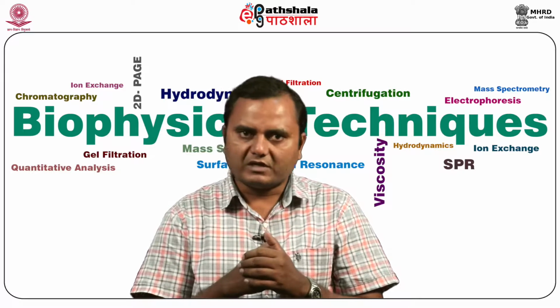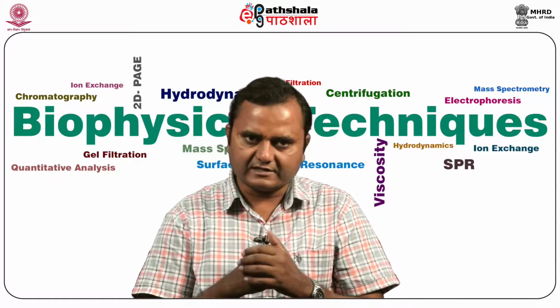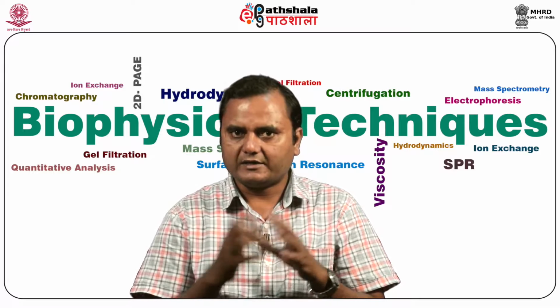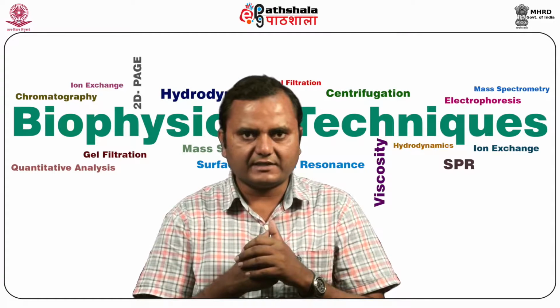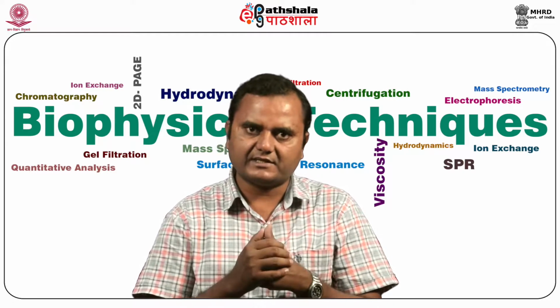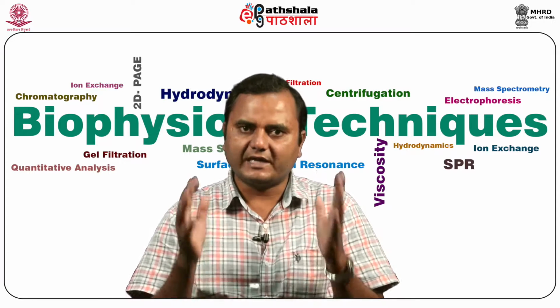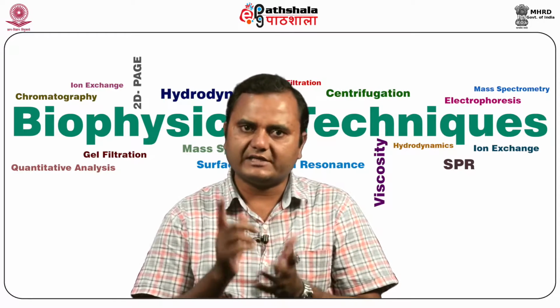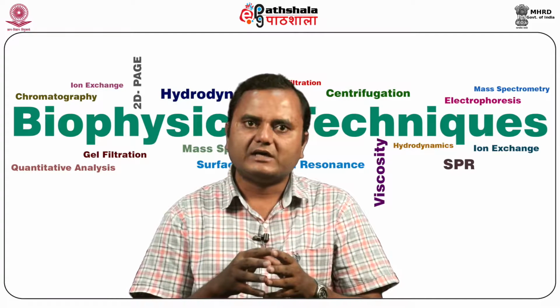So here we talk about the design of the optical system of the ultracentrifuge. If the ultracentrifuge is preparative, it doesn't have any optical system, but if it is an analytical system, then there should be an optical system which is used to take the actual picture, the dynamic picture, of the molecule which is running during the centrifugation process in the ultracentrifuge.